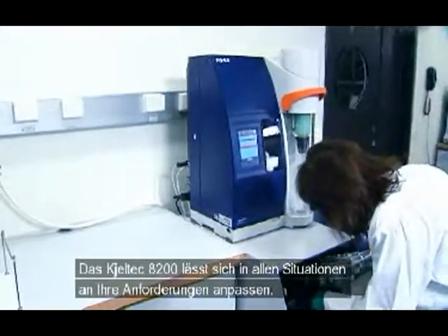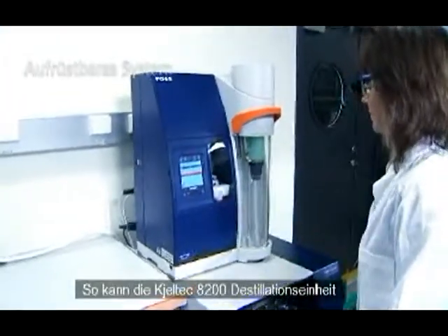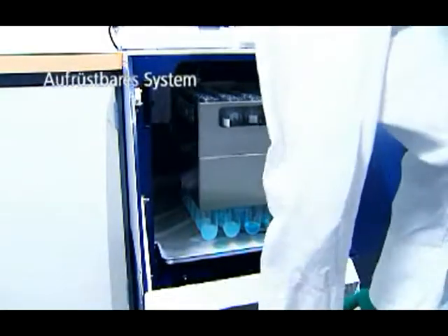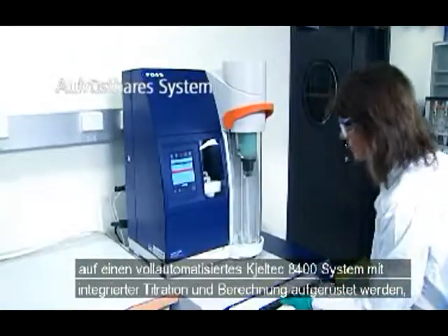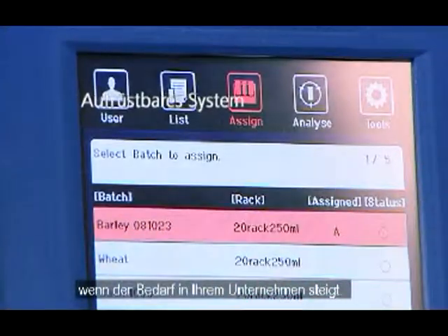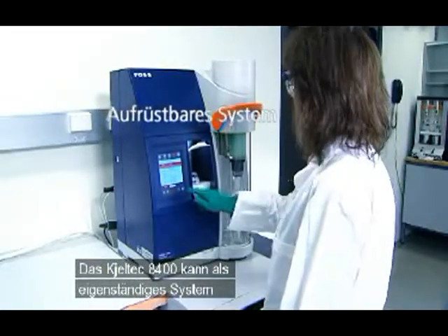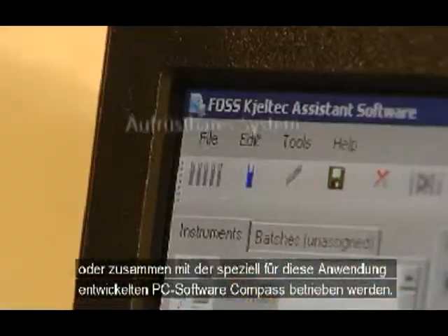The Kjeltec 8200 is always ready to fulfill your needs. As your business grows, your Kjeltec 8200 distillation unit can be upgraded to a fully automated Kjeltec 8400 analyzer with integrated titration and calculation. The Kjeltec 8400 can be used as standalone or together with dedicated PC software, Compass.